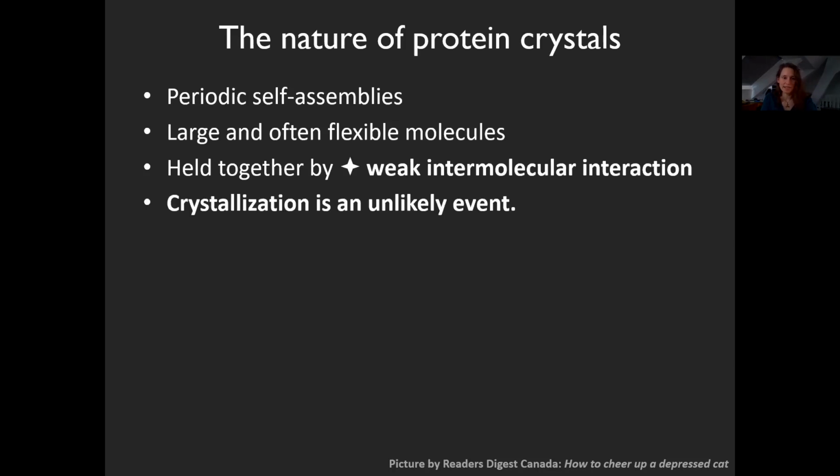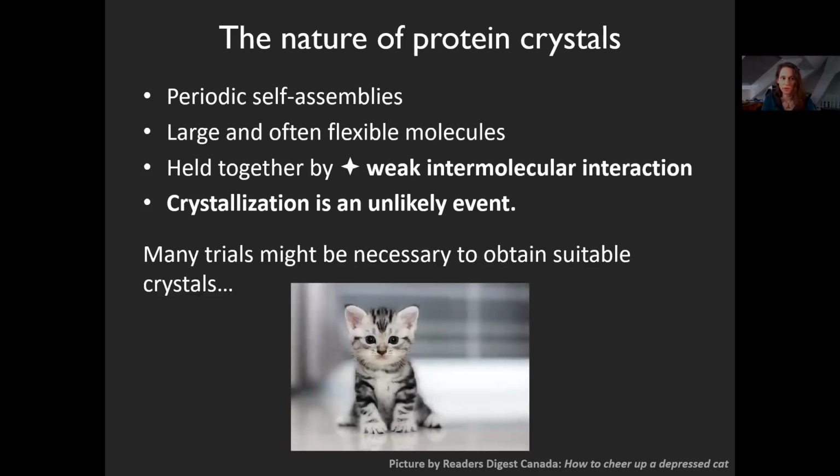Many trials are necessary to obtain suitable crystals because crystallization is an unlikely event for such molecules, and you also need an extremely pure protein to start with. So this really is a major difference that we explain to people who come from small molecule crystallography, where crystallization can be a method of purification. In protein crystallography, we really need to start with something that is already rather pure.